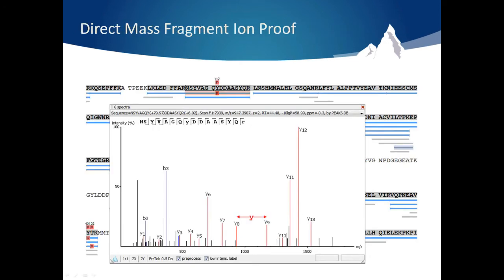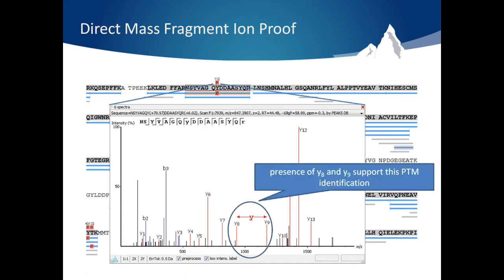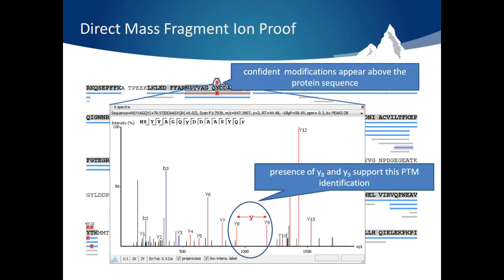PEAKS also has the ability to assign PTM confidence based on direct fragment ion proof. So if the MS-MS spectrum shows fragmentation before and after the proposed modification site and is above 5% relative intensity, it is considered confidently modified. In either case, if the PTM is considered confident, it will appear above the protein sequence.